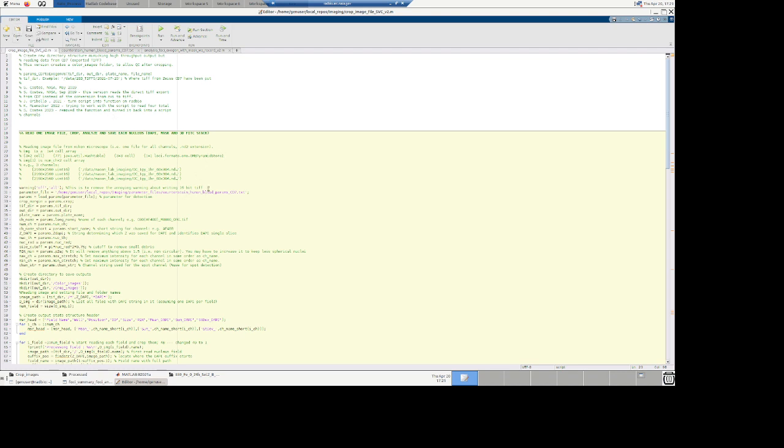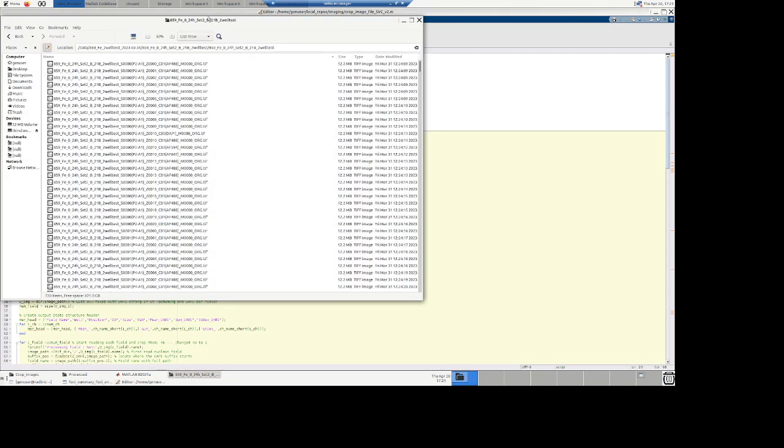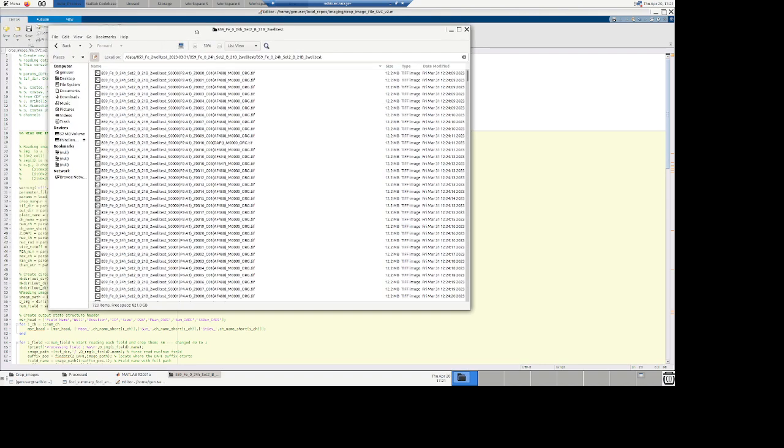It was generalized to allow not only the spot detection, but to do some other computation, looking at a multi-channel image. So before I go into the code, let me show you an example set that we have. Right now I'm on radbio.arc.nasa.gov. To get there, I'm using RDP, the remote desktop option. And to get there, you need to be on VPN. So this is impossible for you to see until you have VPN.